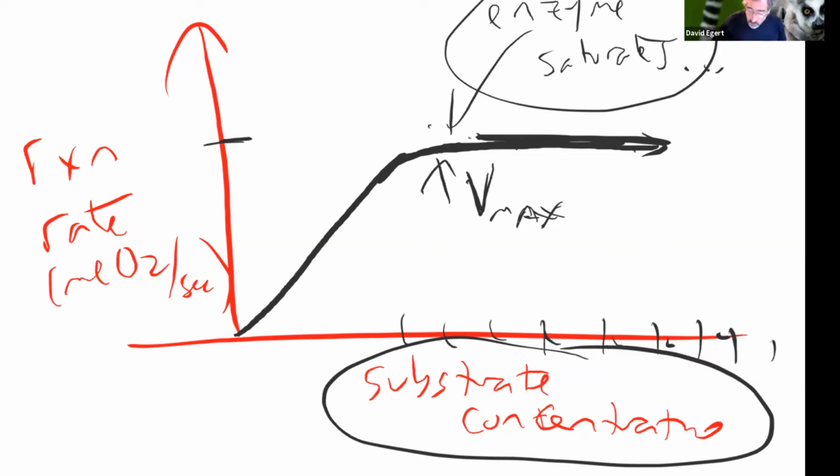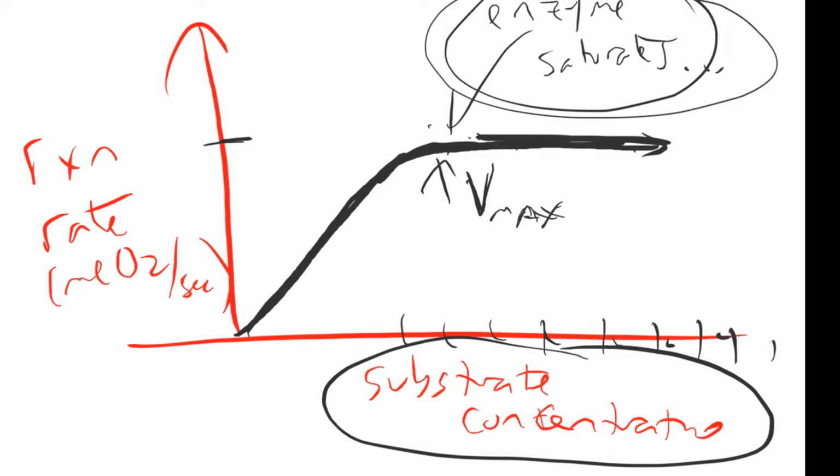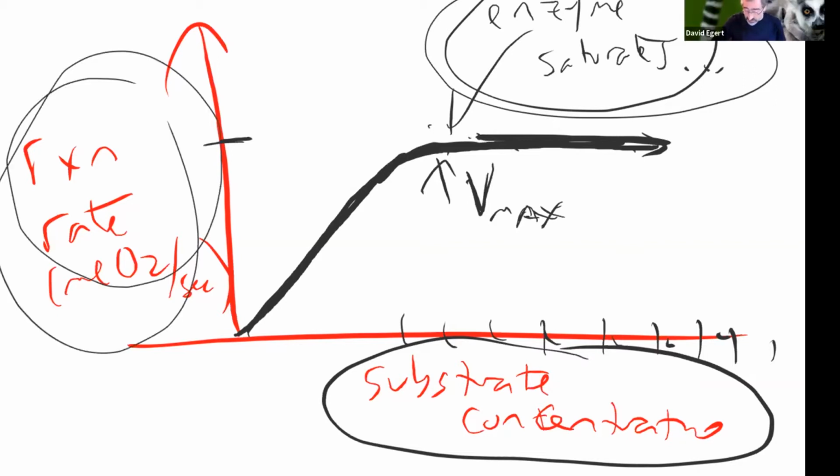How will we know if we hit enzyme saturation with our experiment? Would it just be like a constant stream of oxygen or bubbling? Well, it's going to be the reaction rate isn't getting faster, even though you are increasing the concentration, right? You can't tell if you are at saturation by looking at any one particular run of the experiment, right?